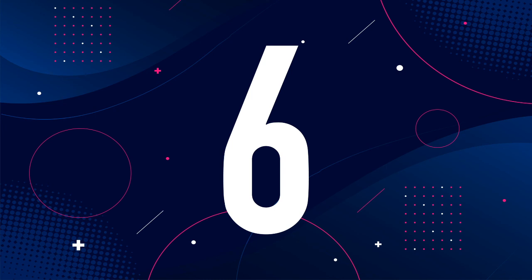Excellent. Good job. You observe some gram-negative diplobacilli bacteria. What color would these be? Okay, they're gram-negative. What color are they? Pink. What would their morphology be? Morphology meaning shape. Two and bacilli, so they're rods, right? So like two rods.